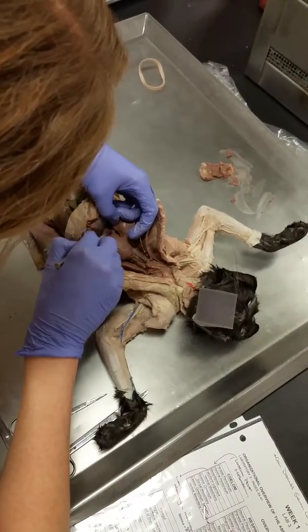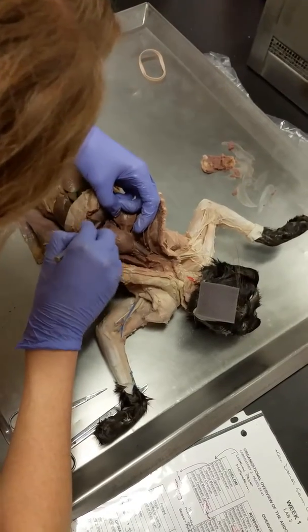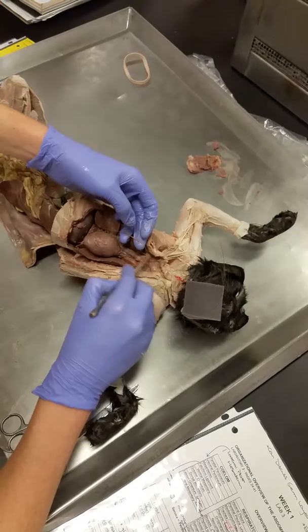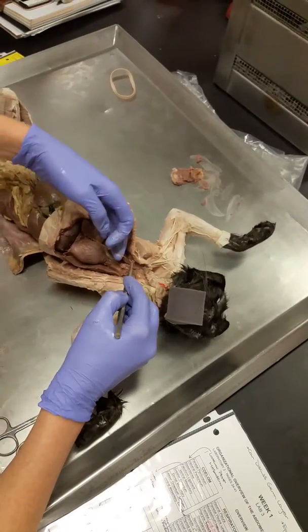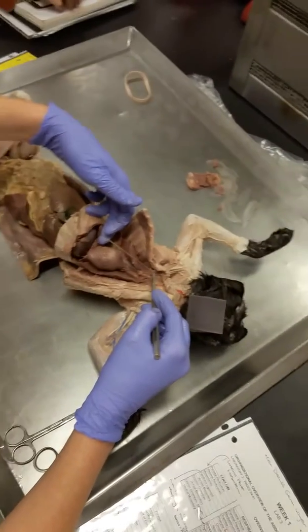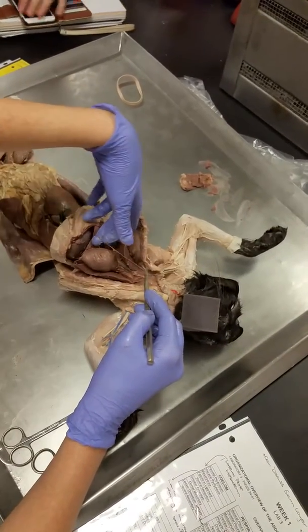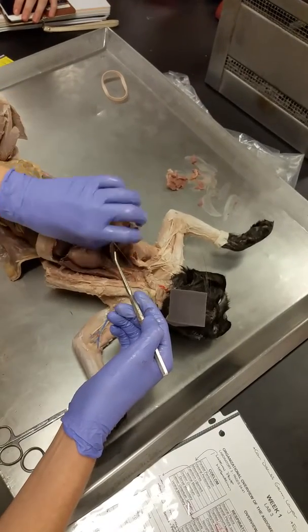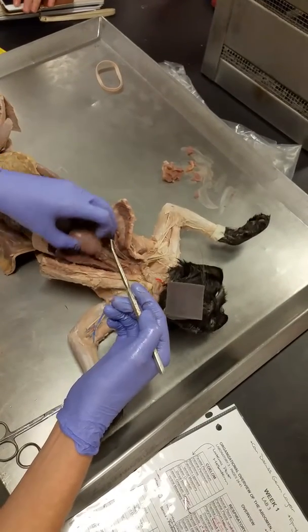And it will go right up to the diaphragm because the phrenic nerve is the innervation of the diaphragm. So that's an important one. You got to know phrenic nerve. So get your phrenic nerve free, at least on one side, if not both sides, because you've got two of them.